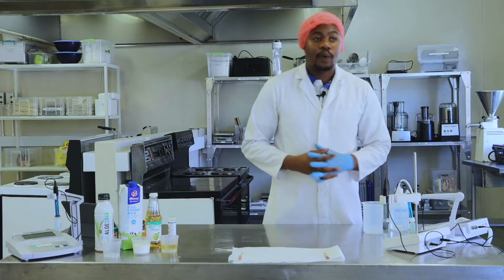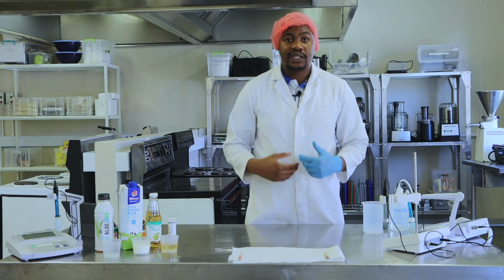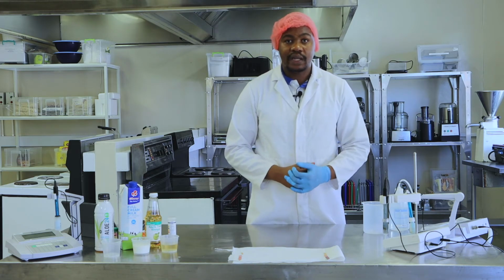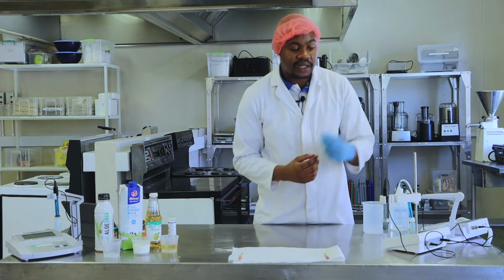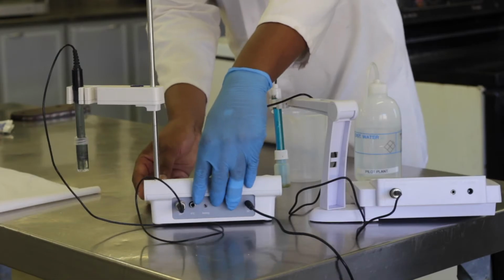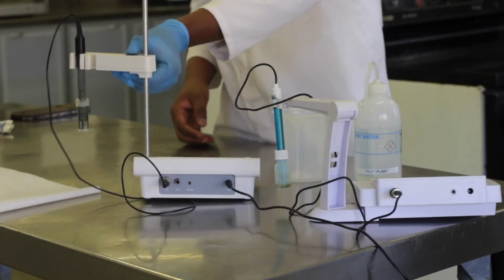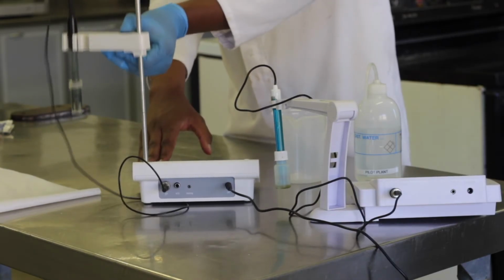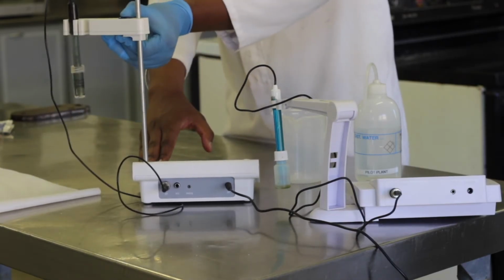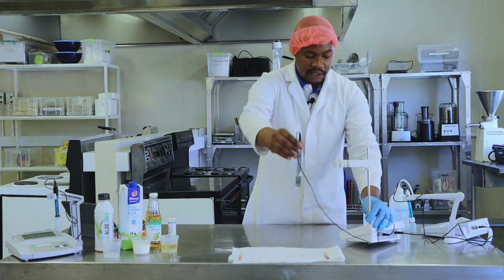So now, whenever you're going to use a pH meter or any equipment that is going to come in contact with the product, it should be cleaned. So the first thing that I'm going to use is to clean my pH meter. You can also pull it closer to you, and if you press here, you can move the probe up and down to adjust it. In this case, you can then take out the probe like this.